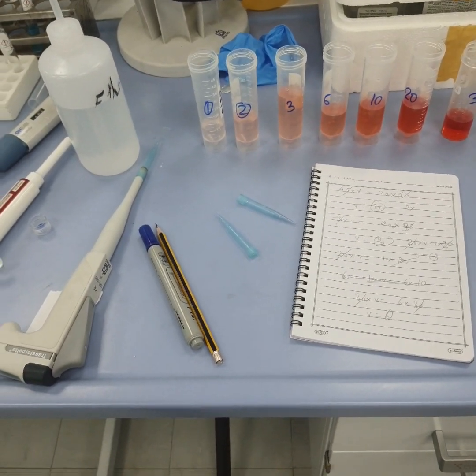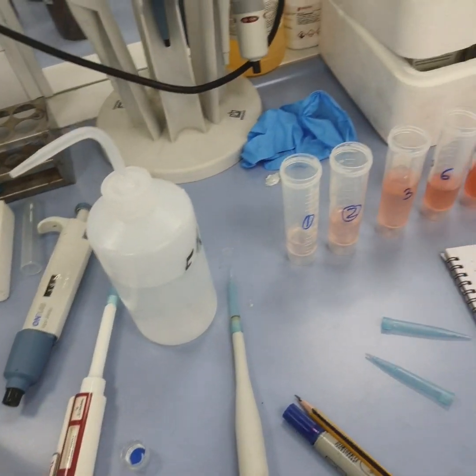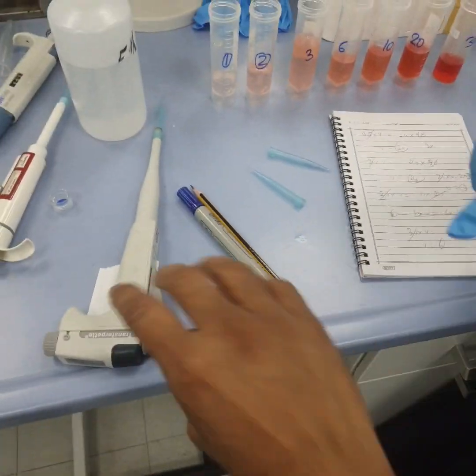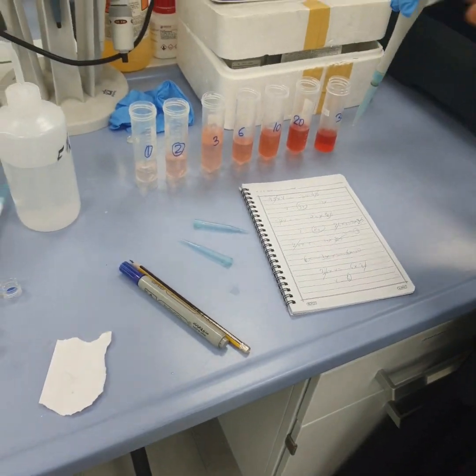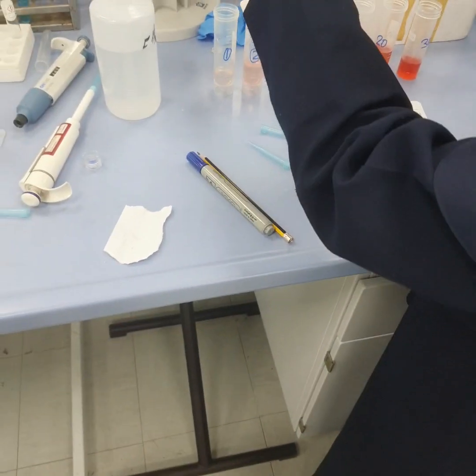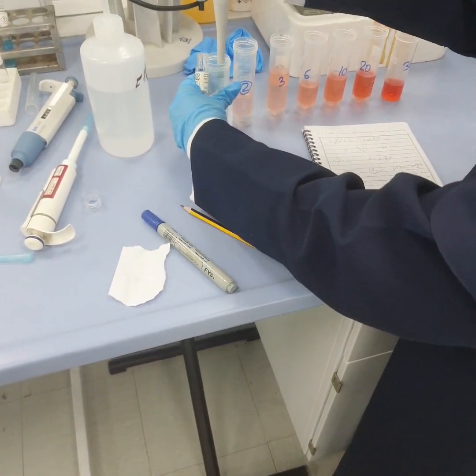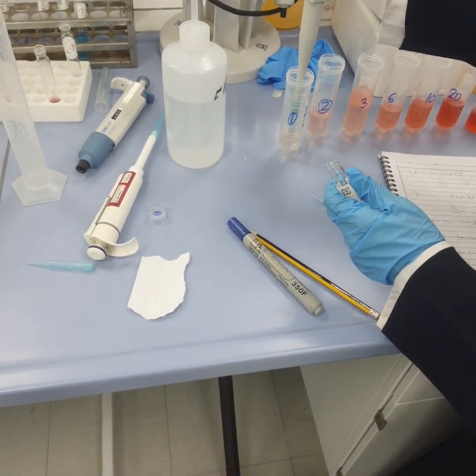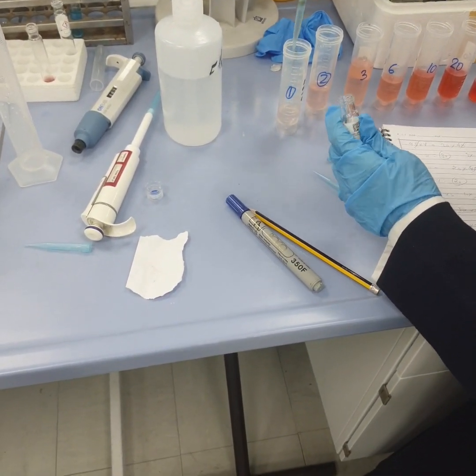You can come ahead and transfer to this clean vial with the micro pipette. This is my clean pipette. Transfer 1. From 1, right? Yes, from 1, carefully. We need around 2 ml to measure. Okay, just transfer.